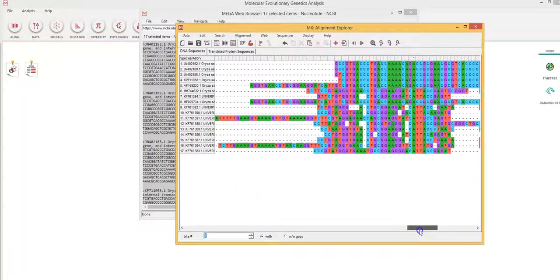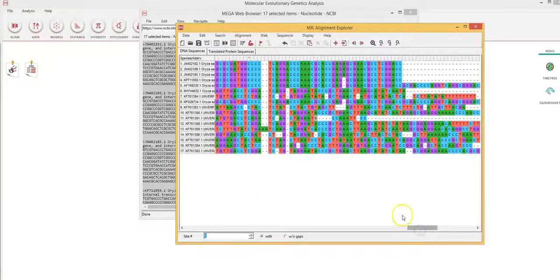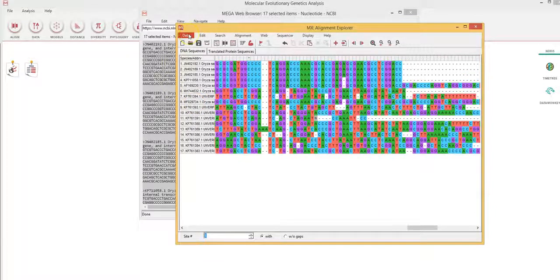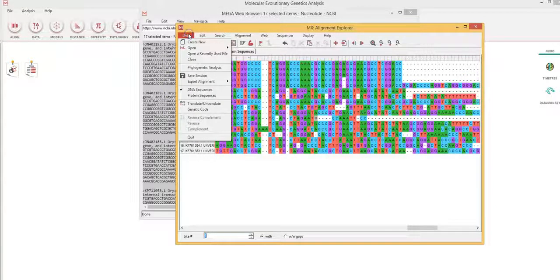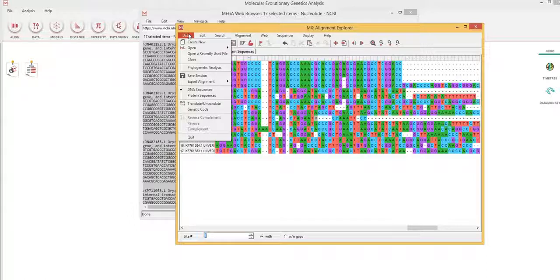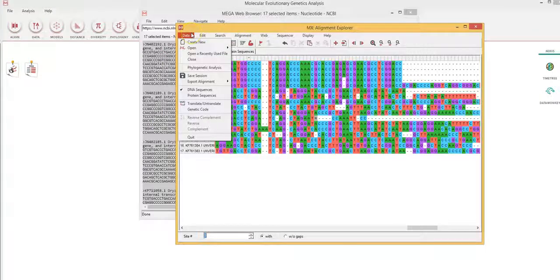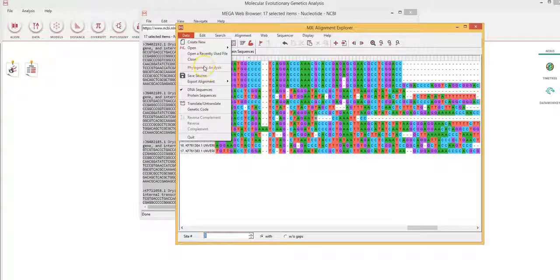So now you can see that they have all been aligned. Now I can save this file or I can transfer it to phylogenetic analysis. So I'm going to click on phylogenetic analysis.